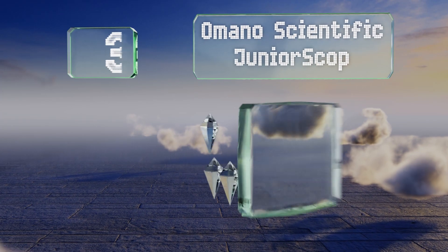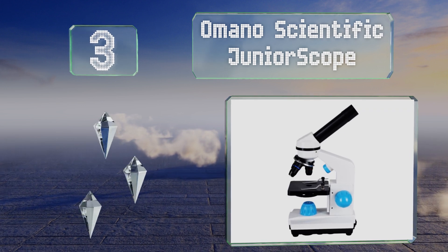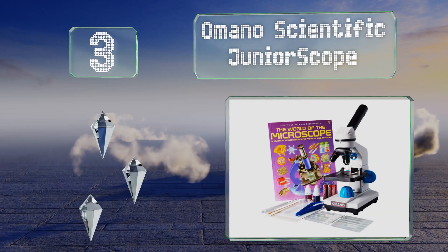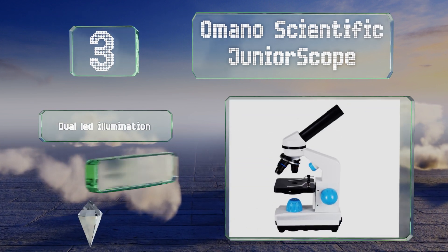Nearing the top of our list at number three, the Omano Scientific JuniorScope comes with everything a young scientist needs to start conducting serious research, including labeled slides, dyes, droppers, and a handy instructional book filled with projects and activities.